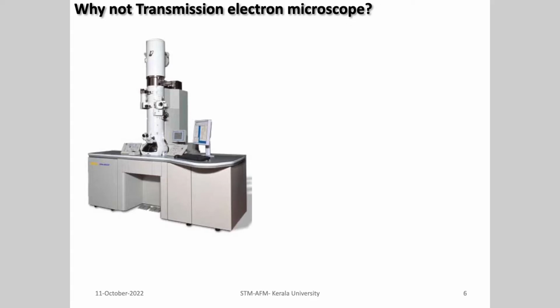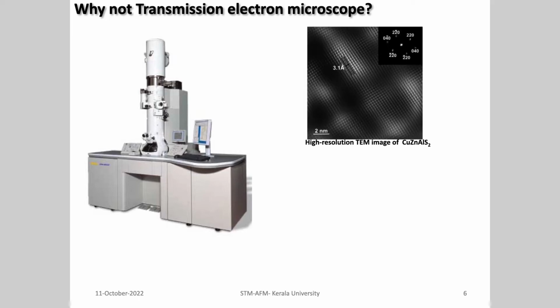Yeah, so if you want to look at the surfaces at atomic resolution, to see atoms, you can actually use a very famous method, the transmission electron microscope. I think that's a class on TEM, right? No, that's not TEM, because it's hands-on. So you can use a transmission electron microscope to look at the atomic structure of materials. But what you see in a transmission electron microscope is actually not atoms. This is an image from my own paper. You can beautifully see the atomic resolution.